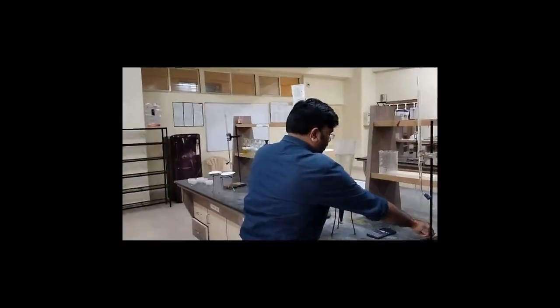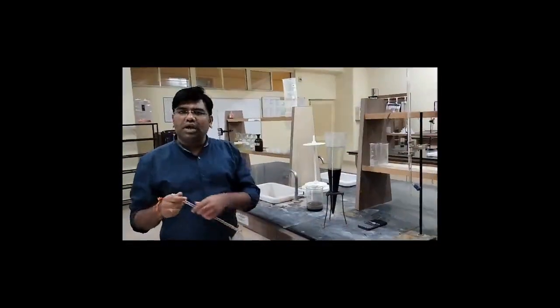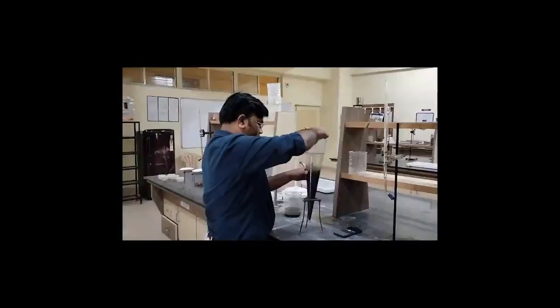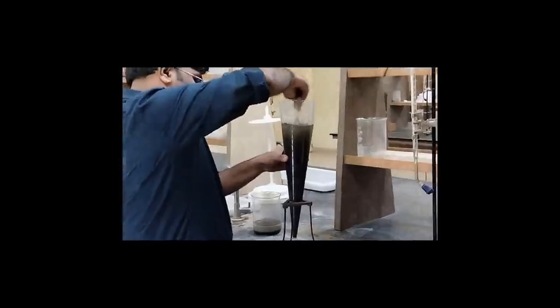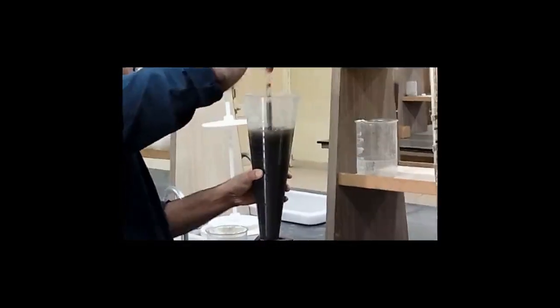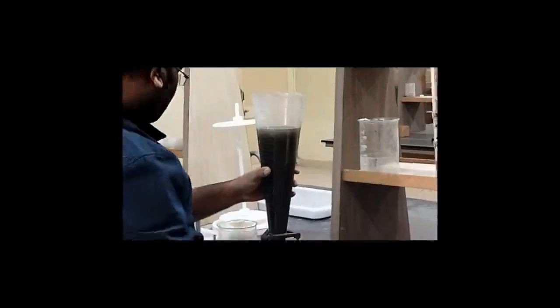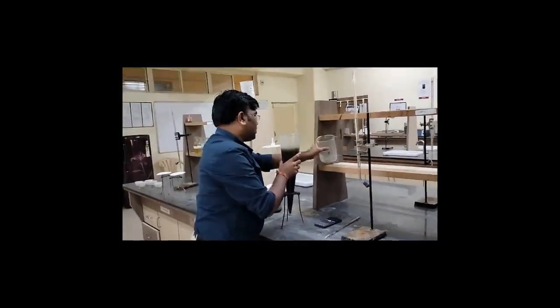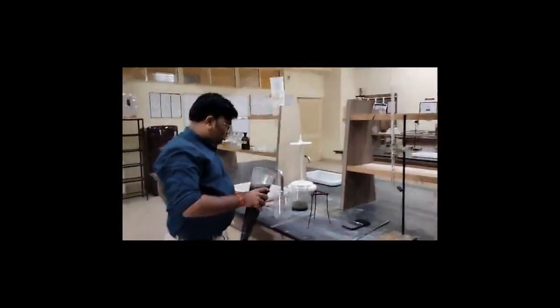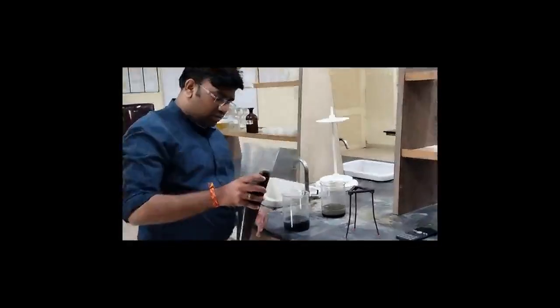So what we are going to do is take a pipette, a damaged pipette can also be taken, and we have to stir this sample, right? A proper stirring of this sample is to be done. After stirring, many times it may so happen that the sample will start to settle again. So you can remove it in this measurement cylinder, sorry, the glass beaker as well.